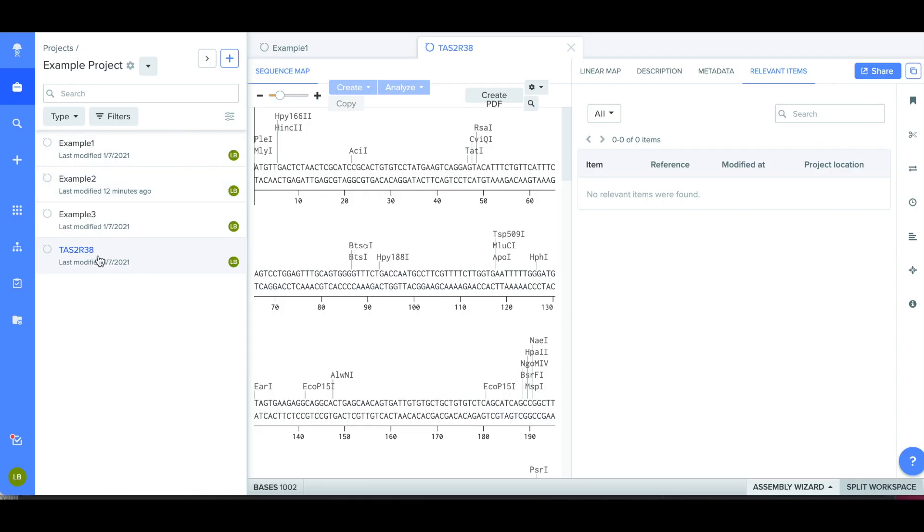To compare the sequences, also known as aligning them, first click on the TAS2R38 reference sequence. Then click on the button on the right hand side of the screen that says Alignment.